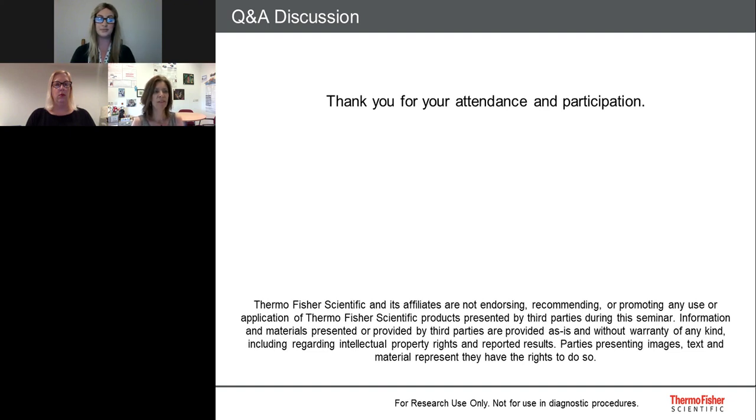That is actually not really new because we also observed that with our CytoScan HD array and also with the 250K SNP array that we used in the past. It's really crucial to use your own process data within your reference set because of minor lab differences and also the lab person's signature that is more or less visible in the data. And we were actually quite pleased with the significant improvements. So we were happy with the result, as you can imagine.